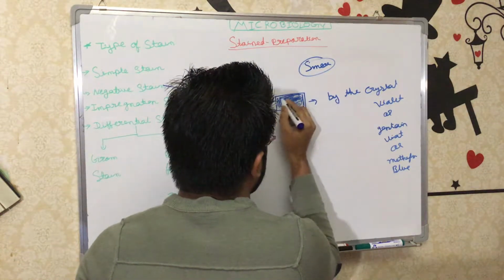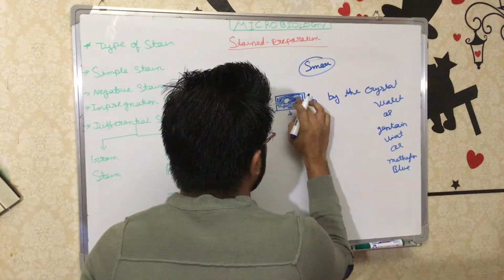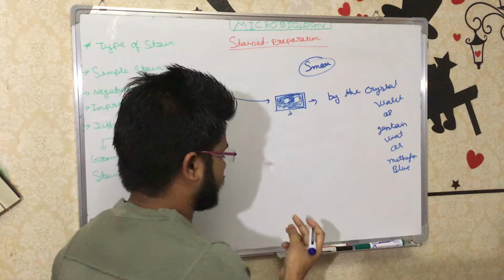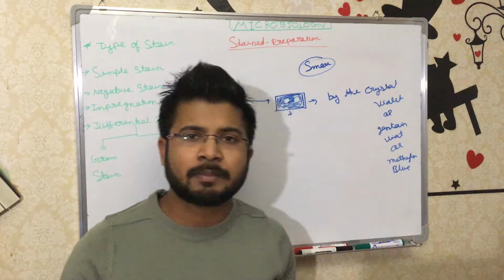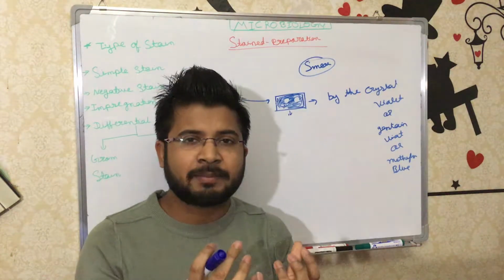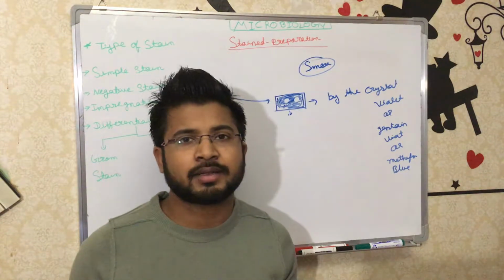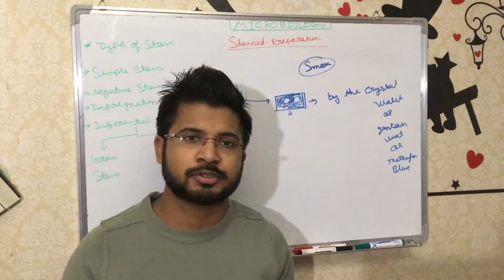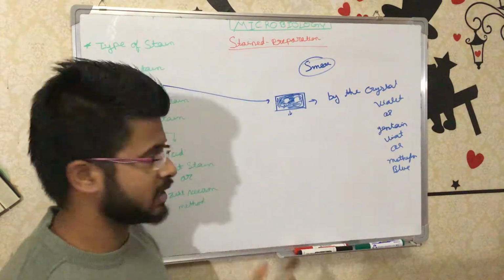This is the background color. And for example, this two is a bacteria. So now in a microscope, again the same problem. In the microscope we can see that everything except the bacteria, the whole background, is blue and the bacteria is white. So again the suspense is whether this bacteria is gram positive, gram negative, or which type of bacteria. So again this method is not a success.